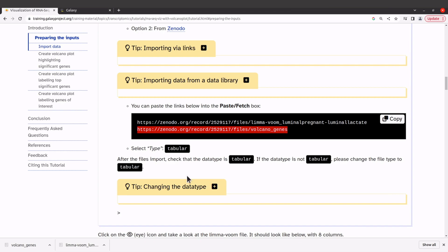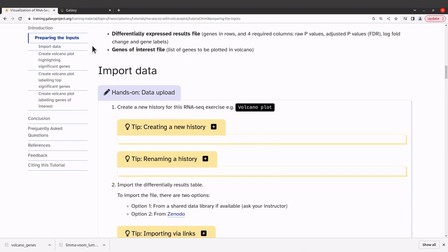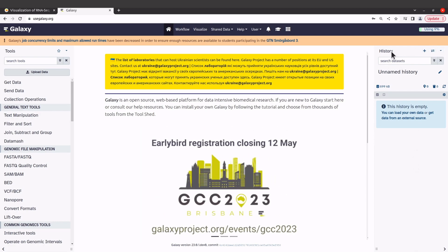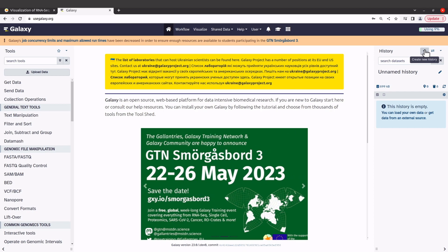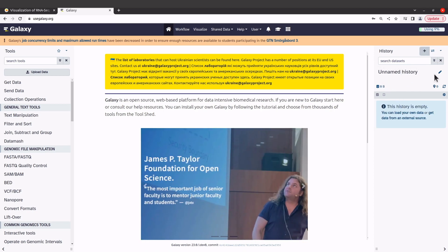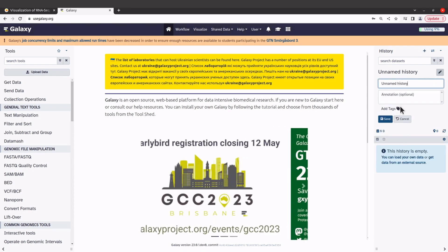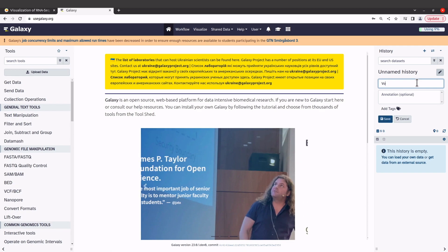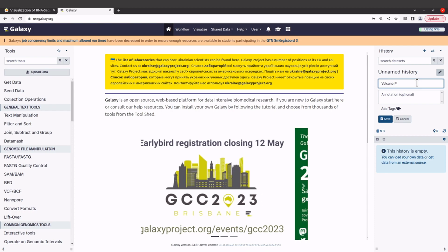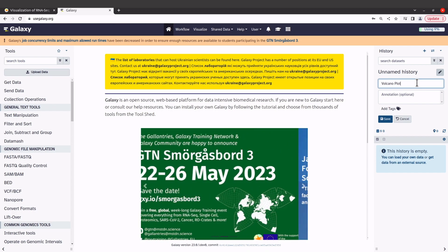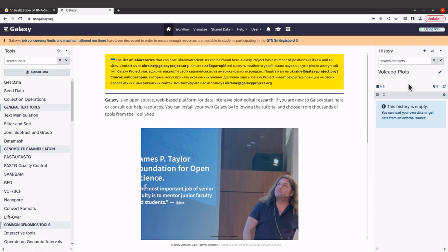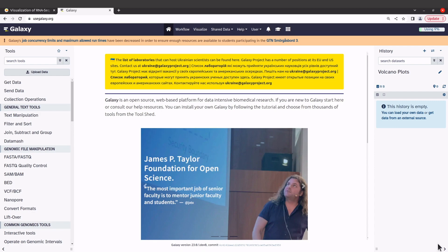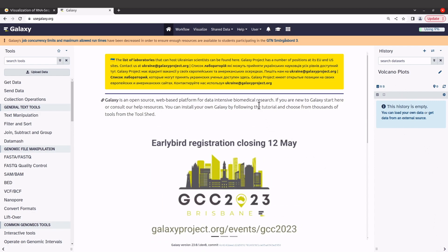Now we have the example data, so let's proceed to the Galaxy platform. When you are there, come to the History panel on the right side and click the plus button to create a new history. You can edit and rename it — I'll clear the default name and call it 'Volcano Plot'. Then click Save. You can give it any name you want.